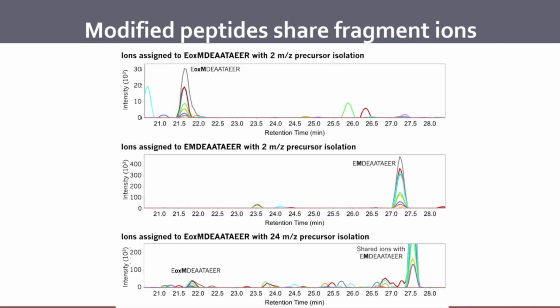So realistically, in this case, yes, but in other cases the ions associated with the PTM are quite different. In many cases, with phosphorylation for example, the PTM mass is so much larger that you don't have to worry about it. You're never going to get a mass shift of 80 unless you're looking at variable width window data, which is again why I stress that variable width window data has some very big caveats. So that's definitely not an issue for these narrower windows.